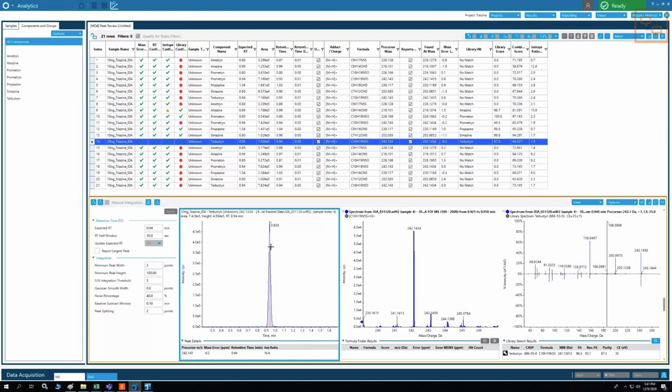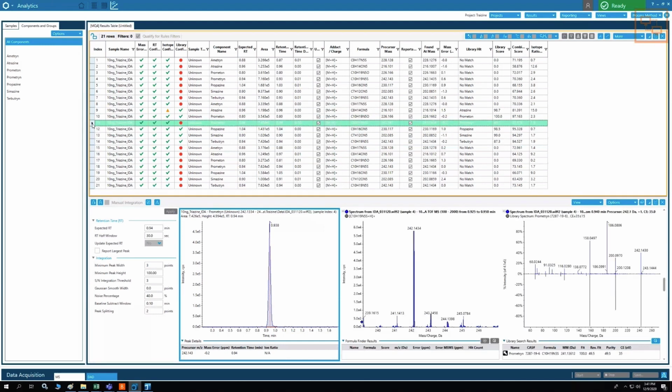All right, good. What happened here? Yes, okay. So this is a more realistic result. Actually, because of that library license problem, I'm just going to reprocess, because I want to show you something in the data, and I want to see if you can work it out. There is one problem with the triazines. We have a red mark there, even though we have a good library match.